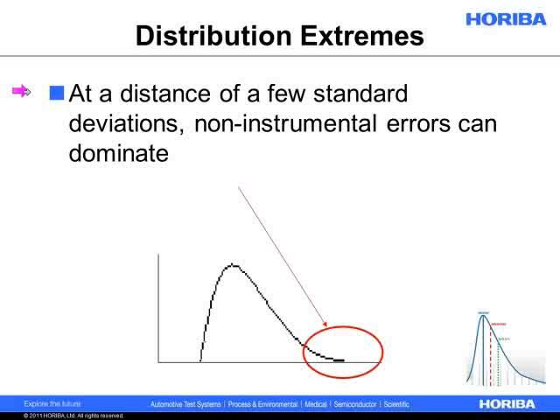All right, so those of you who mentioned that you're monitoring size parameters above D90, these next few slides are aimed at you. I don't want to come off as professorial. I don't mean to lecture anyone, but we've gone through a lot of different method developments where these parameters can be very difficult to reproduce, and we've come across it so often that we decided to talk about it when we discuss general particle size analysis results.